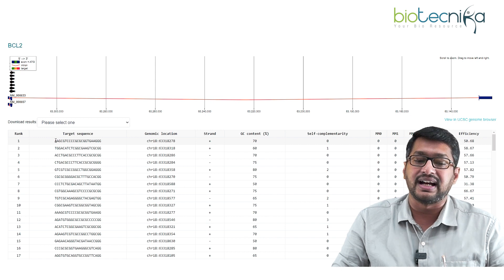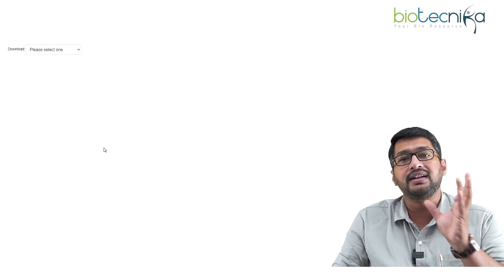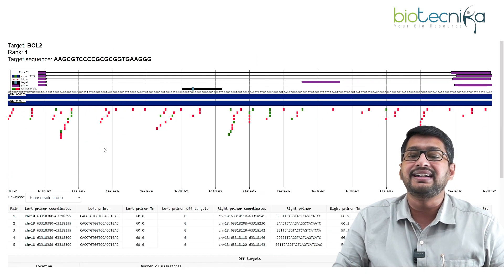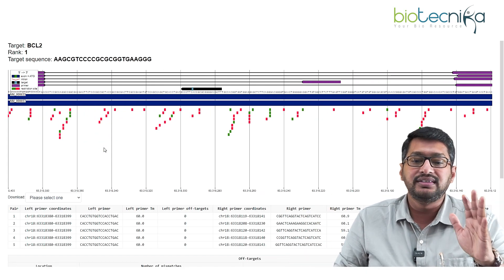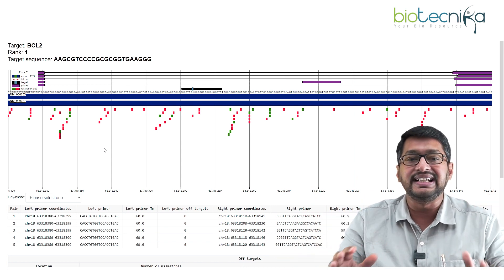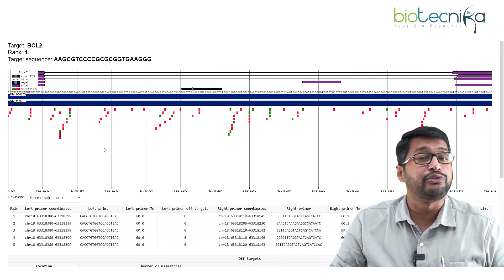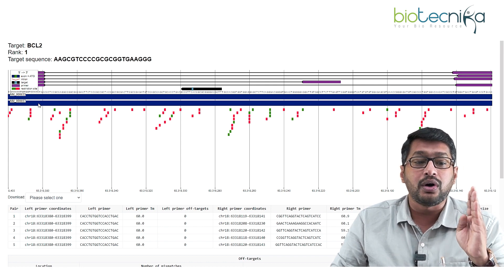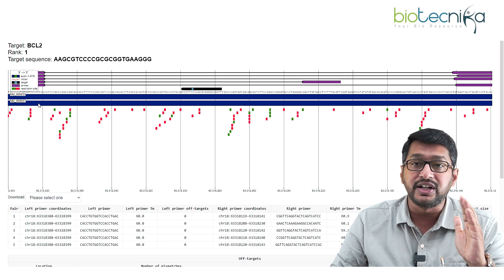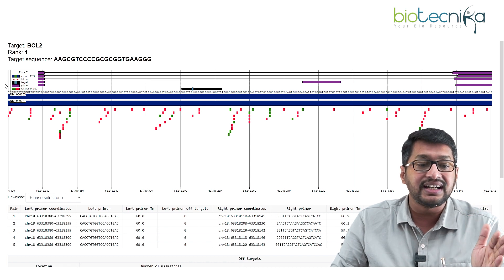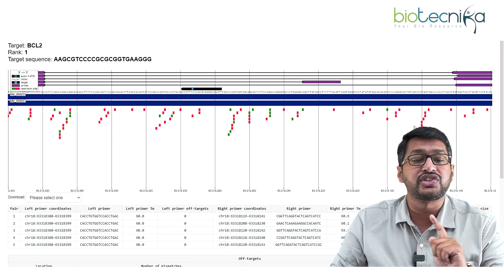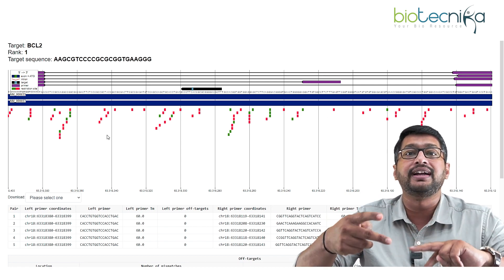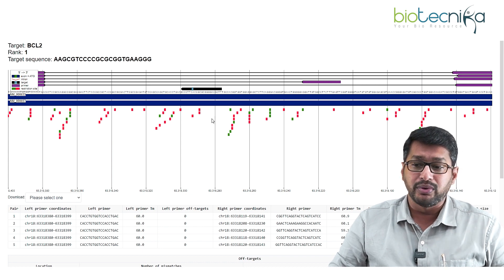Once I identify my target sequence, I can copy it or click on it to open a dedicated new window for primer design. In this new window I can see the number of exons, where the introns are located, where my target is, the various restriction sites, and where exactly my primers can amplify the target sequence.